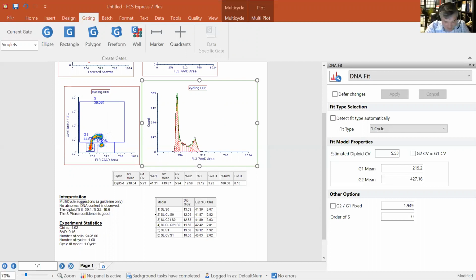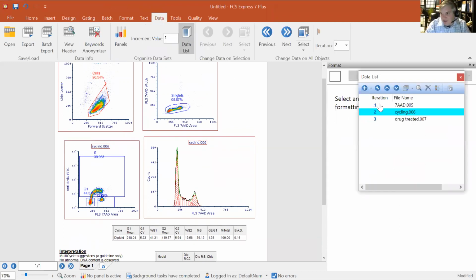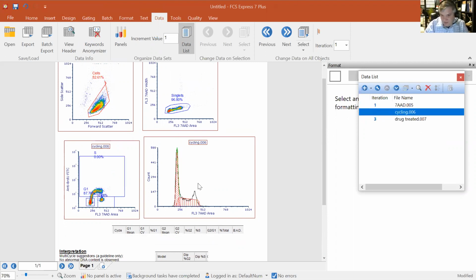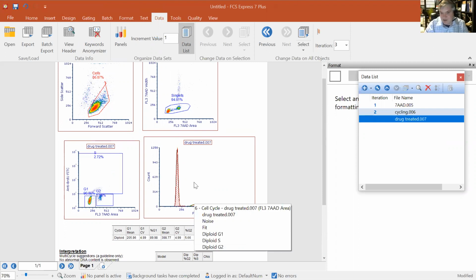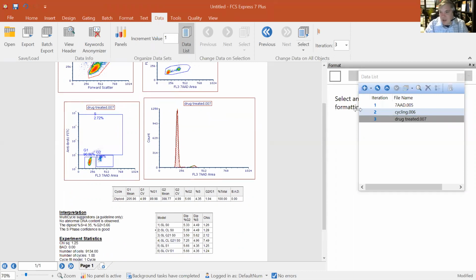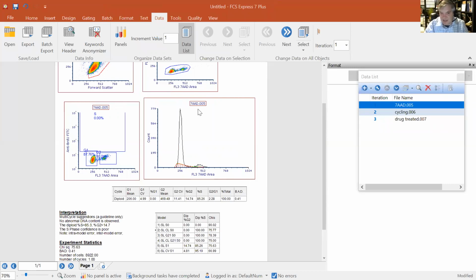Yeah, I wish I had a yes or no answer on that one, like what you should use. Really, with this type of modeling, you do need to look at your data and look at these plots one by one, right? Just because a decreasing S phase works best for my cycling sample, I can see here it doesn't work at all for this one. Or I think it was the drug treated where you're using the decreasing S, right? So you do need to go through these one by one and determine, on each individual sample, what's going to be the best.